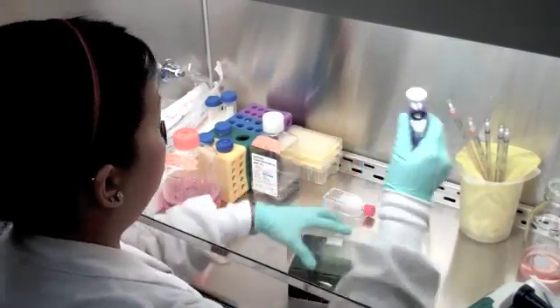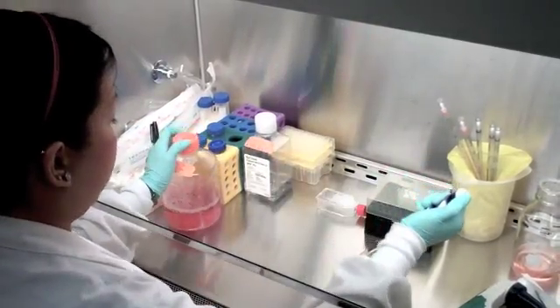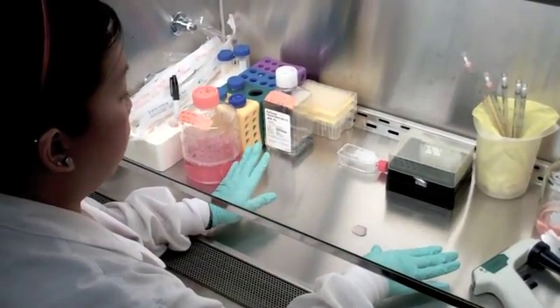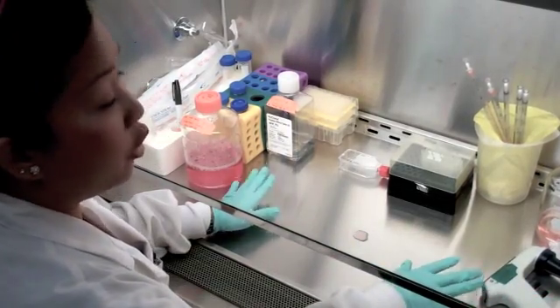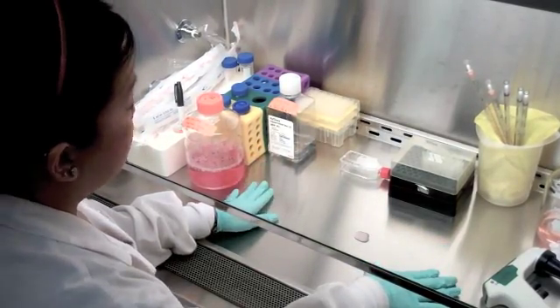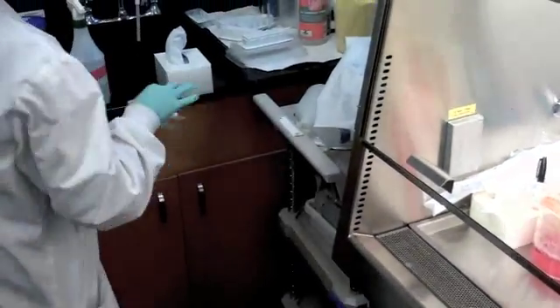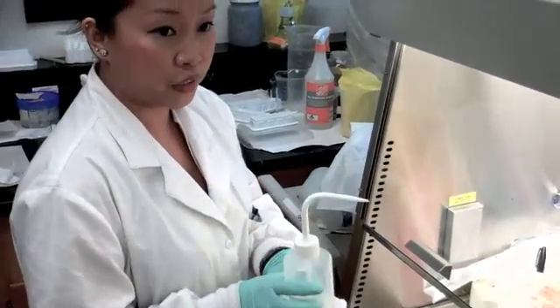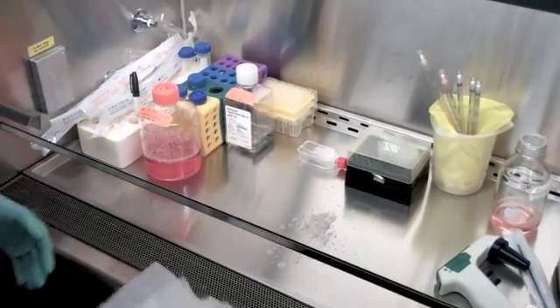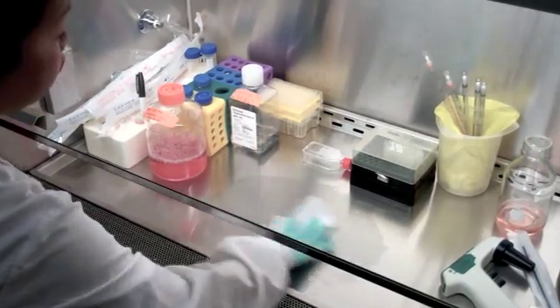Let's say we have a small drop of media in this area. You always want to know any material that you're using and the proper way of cleaning. Not everything can just be ethanol or can just be wiped with soap and water. The right procedure for media is to go out and then wipe with soap and water first — spray the area and then wipe it with a chem wipe. Don't use regular tissues, paper towels, or anything like that. It has to be chem wipes.